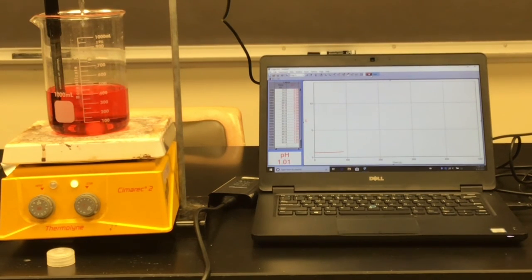We've gone up a little. The pH started at about 0.96 and now it's at about a 1. But again, I've added in a ton of this stuff and it really hasn't changed very much. And I'm still red, by the way. So now I've added in about 18 milliliters, and there's barely a change. I mean, it's going up like we expected it to, but it's certainly not the straight line that we would have expected it to be from before.